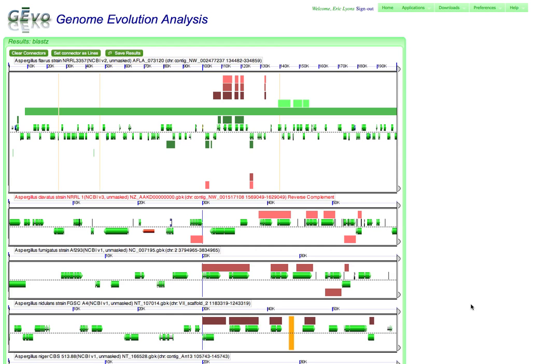Hello, this is Eric Lyons, and I'm going to be showing a quick tutorial on how genomic regions can be extracted from GEVO in order to get the underlying sequence or all of the features.